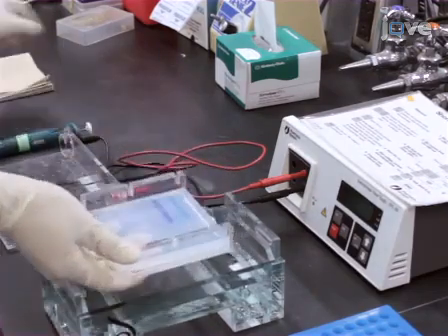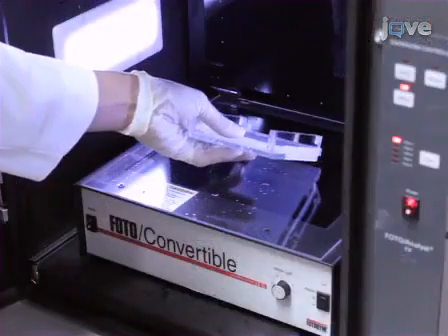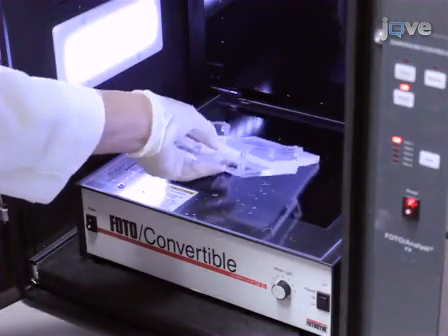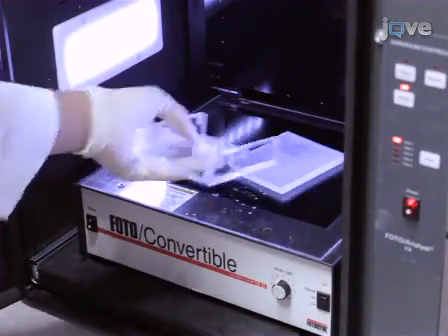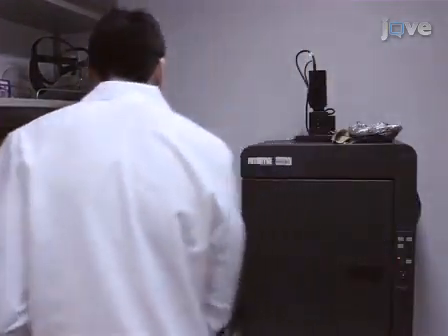Place the gel tray on paper towels to absorb any remaining running buffer. To visualize the DNA fragments, remove the gel from the gel tray and expose the gel to ultraviolet light. This is most commonly done using a gel documentation system.